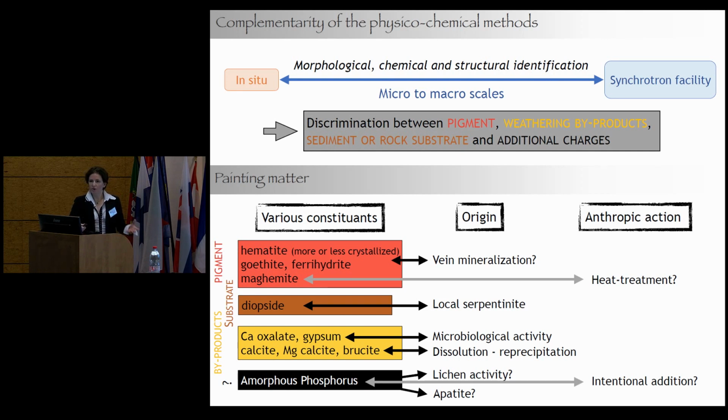Concerning the painting matter, to be able to answer the question, we can make a link and a comparison between the painting matter and the artifact. The pigments are the same. The morphologies are quite equivalent, but what is the clue to be able to say it's the same? It's really difficult to say it's the same. We need to go really further, and we need to be very prudent to clearly pose this hypothesis and go deeper, after evacuating the byproducts and the substrate.